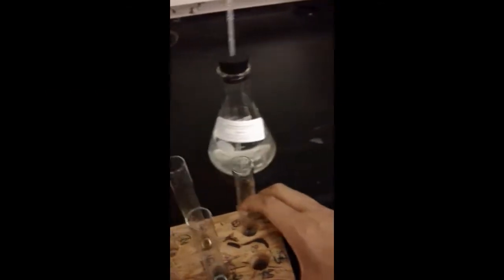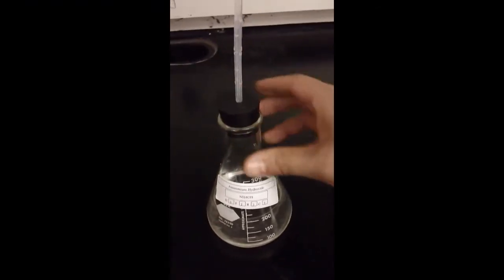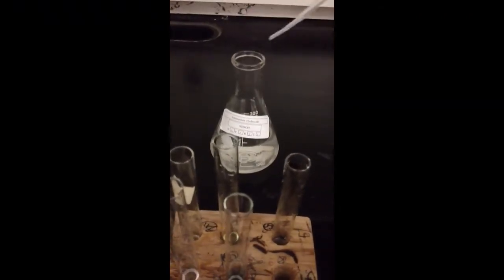Now I need to add 10 drops of NH4OH, and this is my ammonium hydroxide. Double check the bottle, make sure it matches the sign, and then I add my 10 drops.